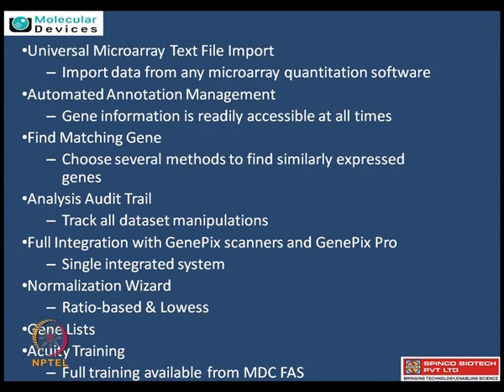So there is an automation management also possible with this. So you have a number of slides coming in every time, so you do an experiment, add on some more. So there is a possibility that you can add to your present experiment itself, right, which gives a very good opportunity that you need not repeat over and over to understand what is happening.